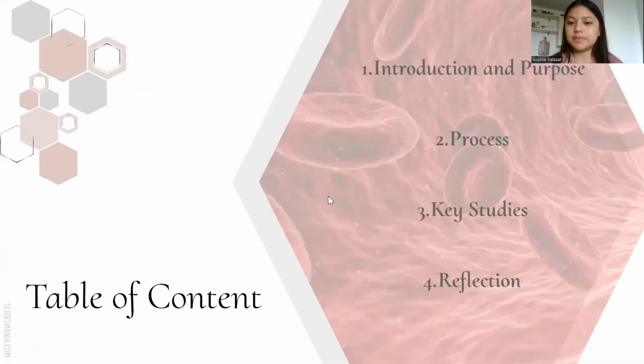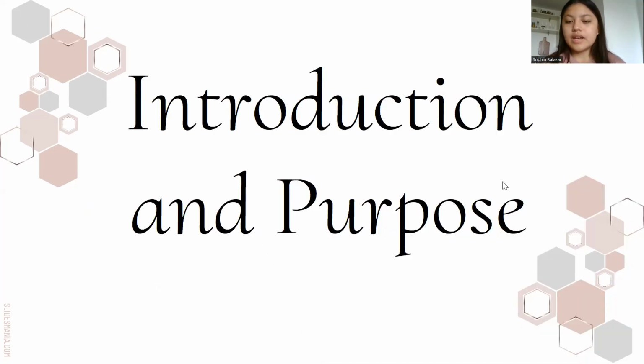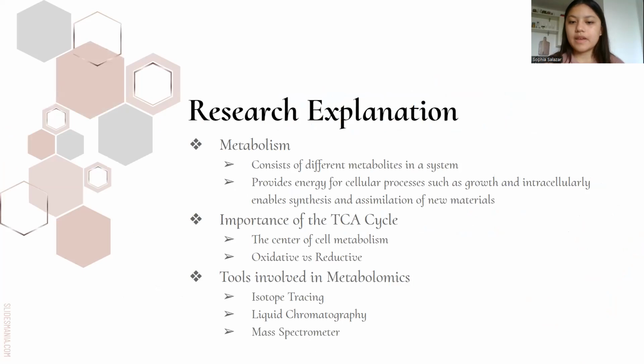So today I will be speaking about my research and my experience in the program through these subtopics: introduction and purpose, process, key studies, and reflection. I will start off with an introduction to what my research is about and its purpose. My whole research project revolves around the idea of metabolism, since I will be examining the different metabolites in red and white blood cells.